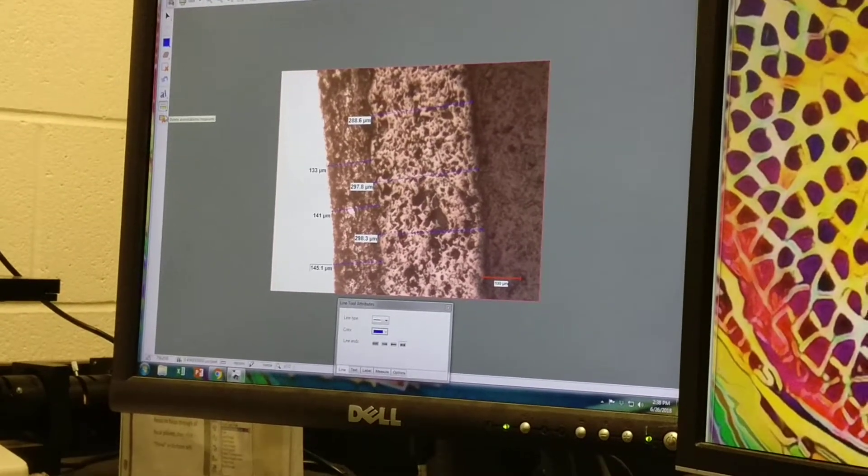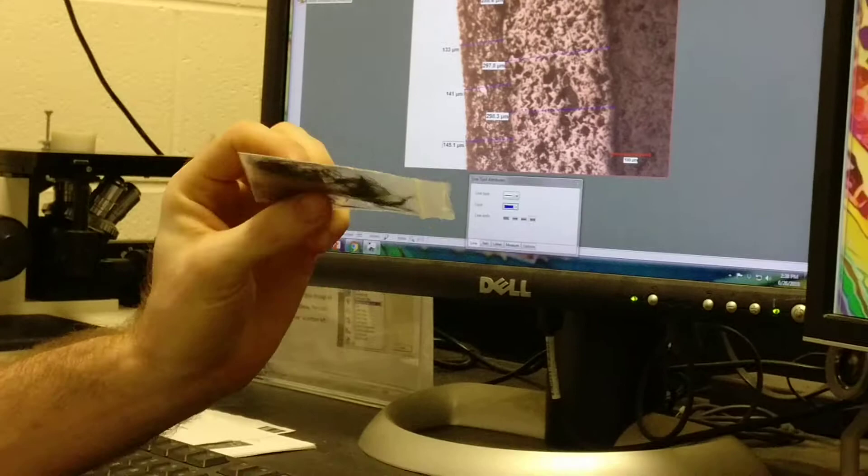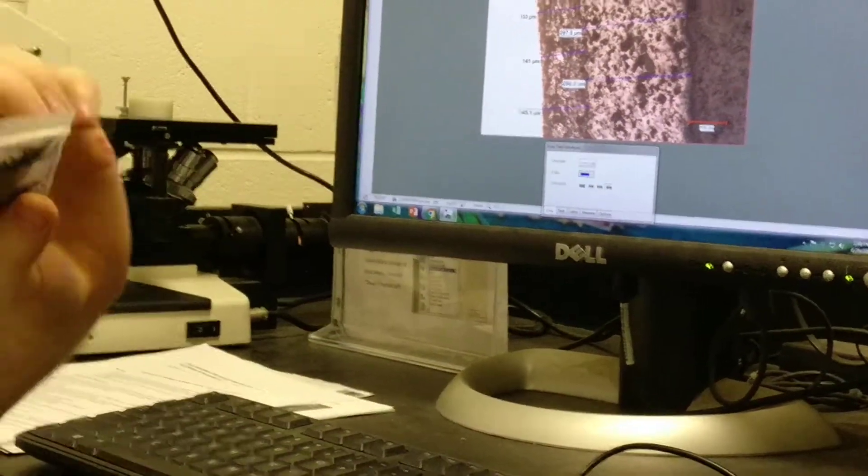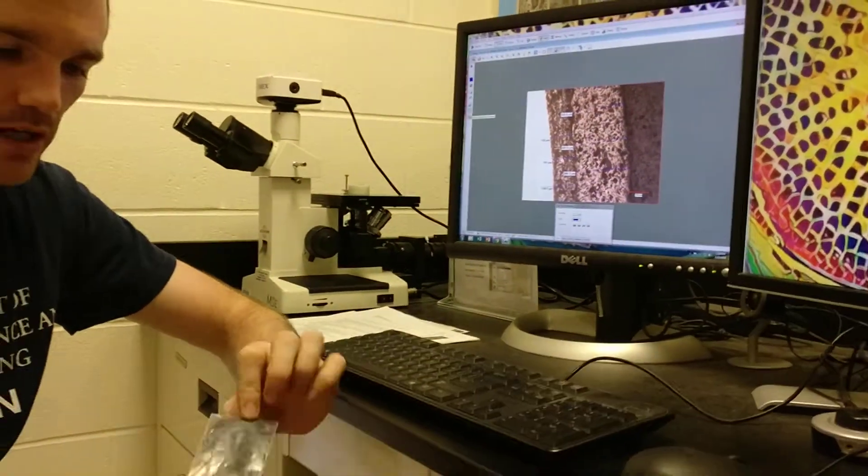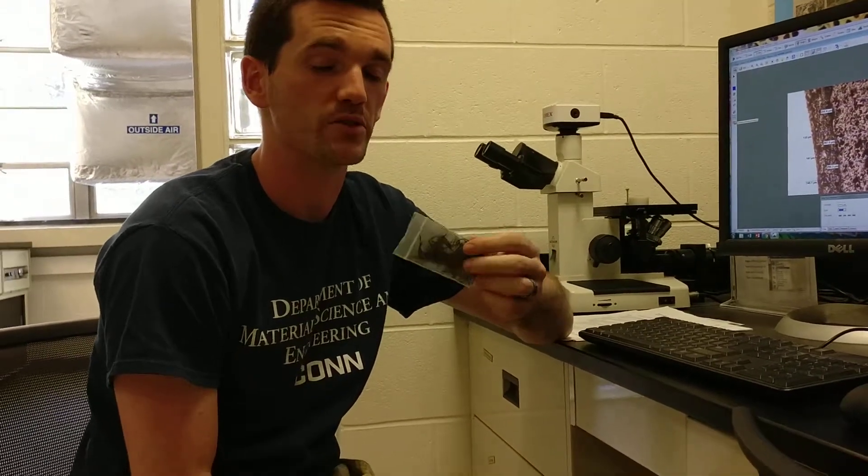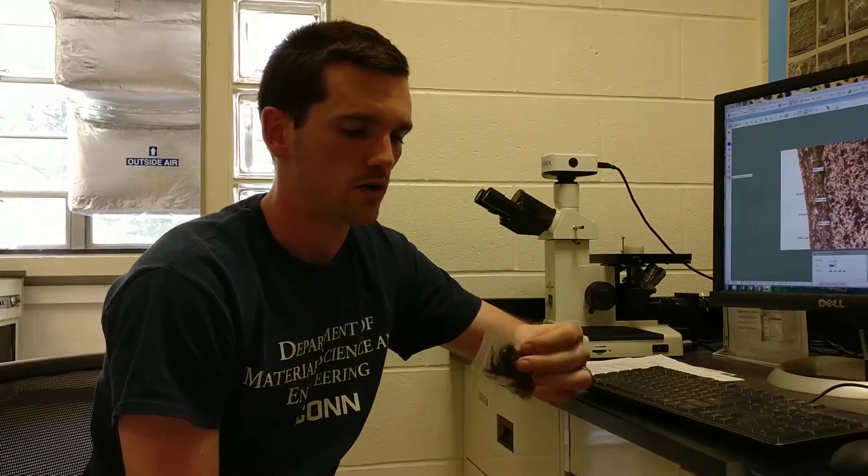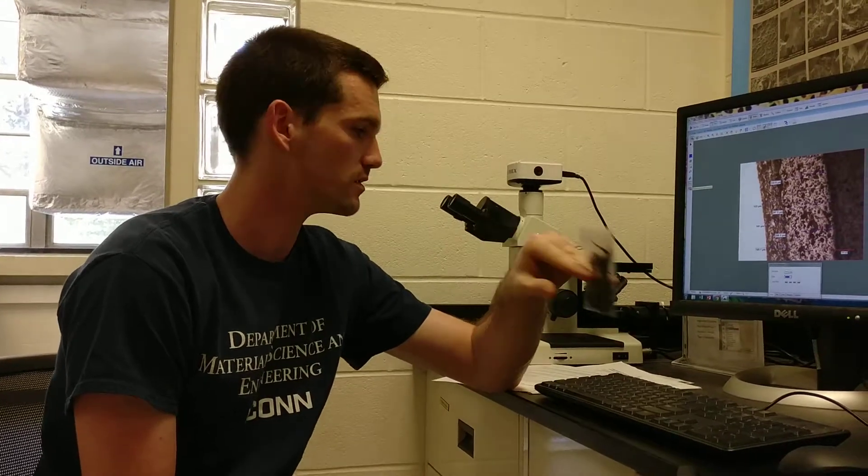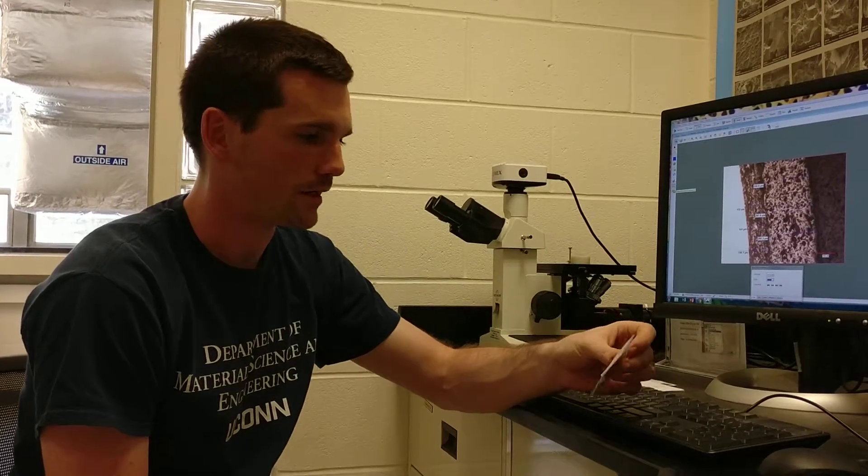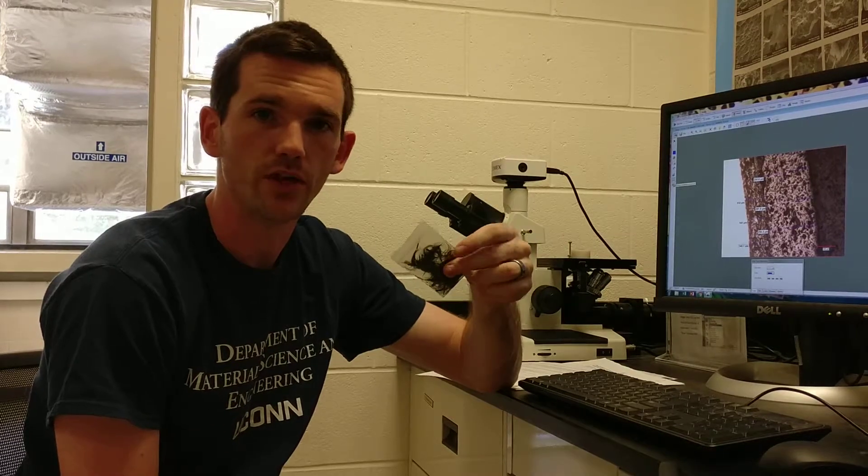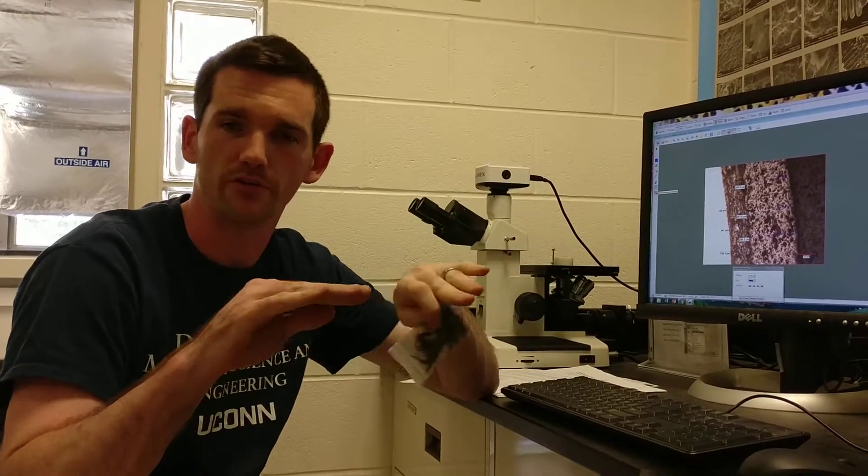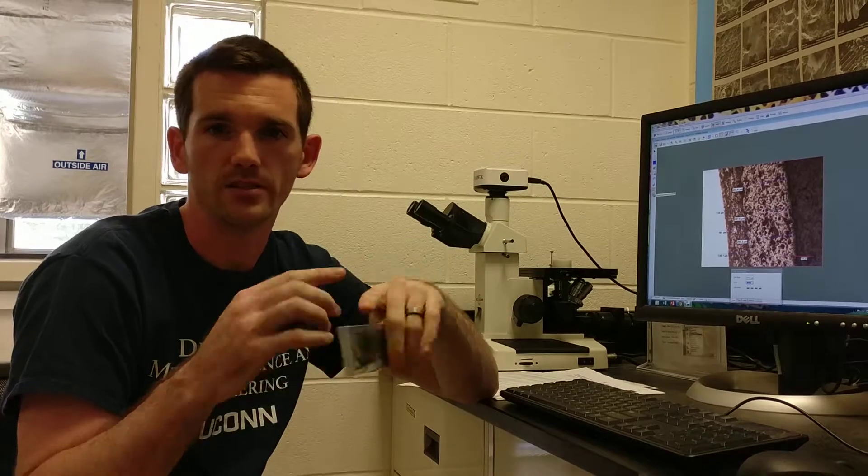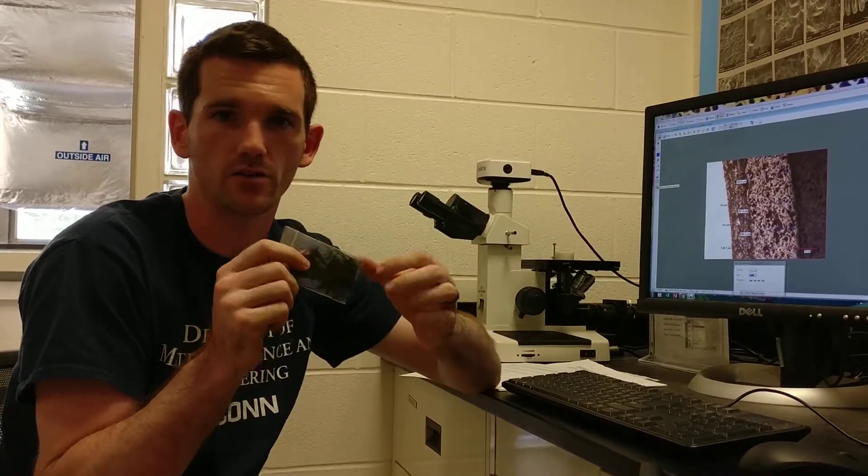The next sample is carbon fiber. If we want to image carbon fiber in this optical microscope, we're going to have a challenge because it's not flat and the size of the carbon fibers is very small. In order to do high magnification, we need to make these samples extremely flat because our depth of field decreases as our magnification increases. You can think of different techniques, but something we've done is put them on top of a glass slide and maybe tape them there or use static electricity to keep them there.